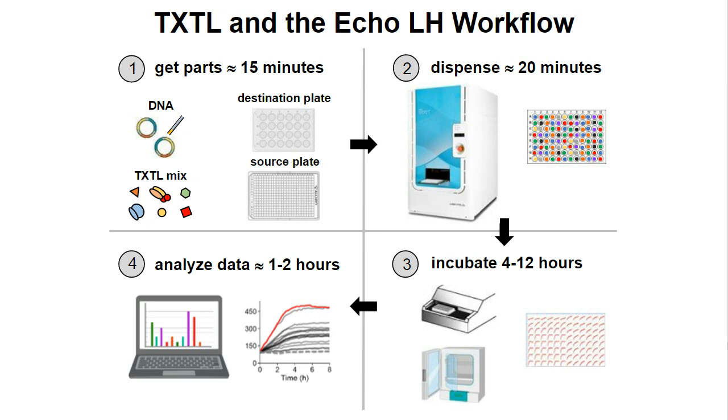And last, that takes about 4 to 12 hours. And last, we get our data, we have our fluorescence measurements, and we can analyze it, and we can get our answers. So that takes 1 to 2 hours, but if it's a repeat experiment, it can take almost immediately.